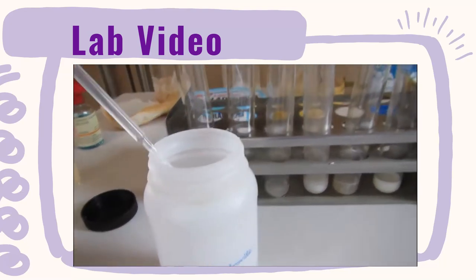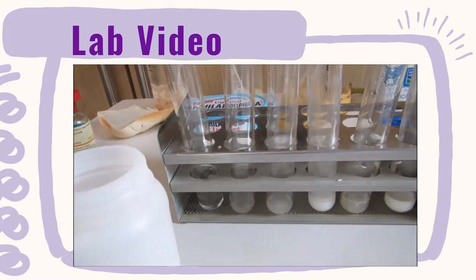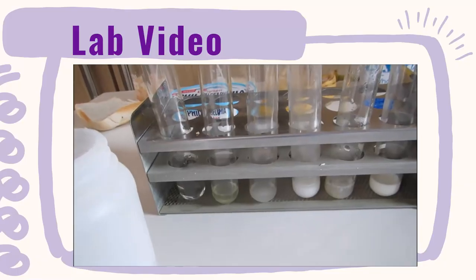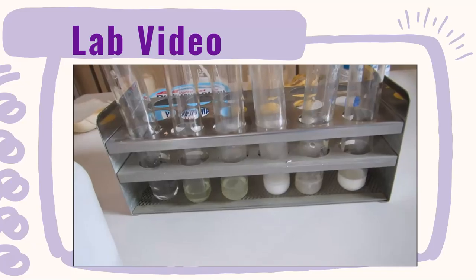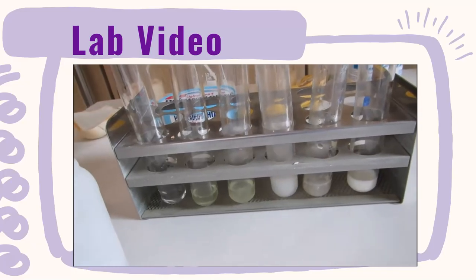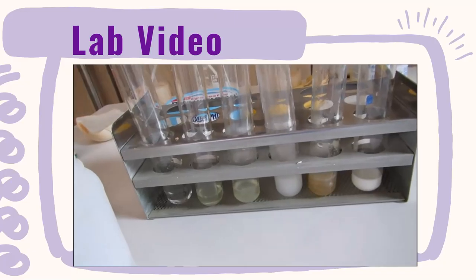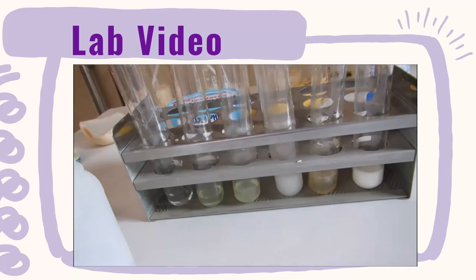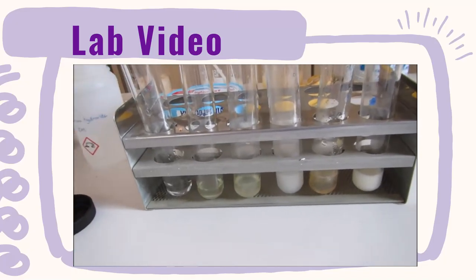So to carry out the protein test, first thing I'm going to do is to add some sodium hydroxide to each of these tubes. Just add in a bit. I'm just going to do it to all. This doesn't actually cause the reaction, but it makes it possible for our next solution of copper sulfate or biuret reagent to react.